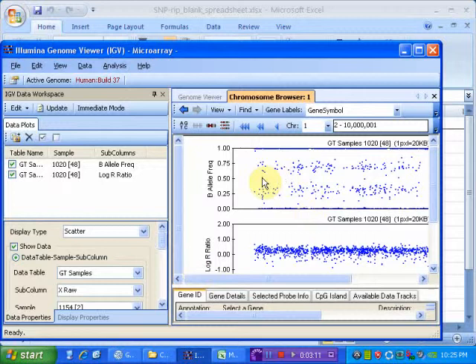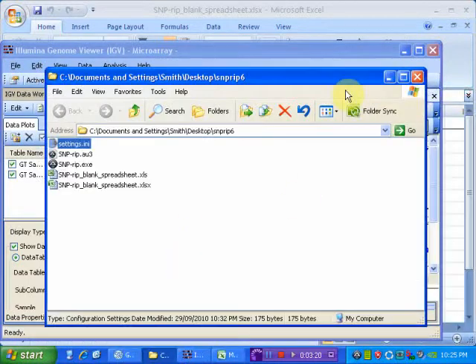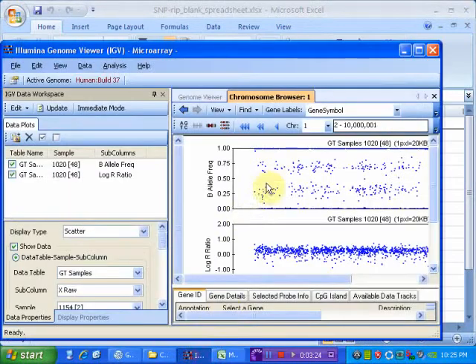But instead of having to be very precise with the mouse, we've got a hotkey called snap to point, as you remember, which is key F1. If I go back here and move the mouse pretty close to a dot, say about there, and press F1, it'll snap to the nearest dot without you having to move the mouse or be precise. Once you've got the mouse there, you hit F2. So it's quite straightforward. I've stopped moving the mouse right there. I'm hitting F1 on the keyboard, and it's auto-moved the mouse. And yep, that's one I want, so I'll hit F2. You can keep doing that over and over.